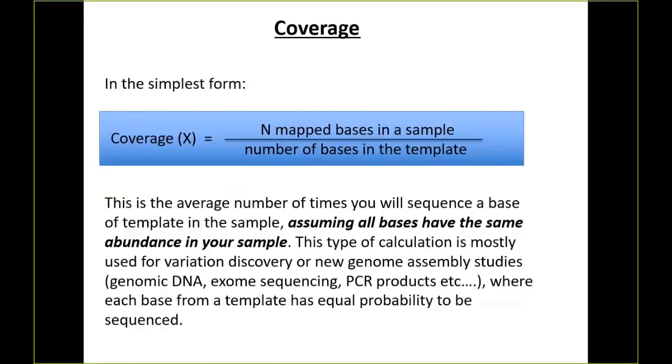So if I read that C once, what can I say about its methylation? If I read that C once, what are the possibilities for its methylation? Its possibilities are yes or no. If I read that same C twice, so I have 2 independent reads of that C, what are the possibilities for its methylation there? 0, 50%, or 100%. If I read it 10x, well, now I can say this C is methylated 0, 10, 20, 30, 40, 50, 60, 70, 80, 90, or 100% of the time. Now I start getting some resolution in there.